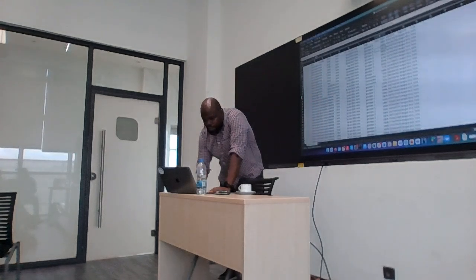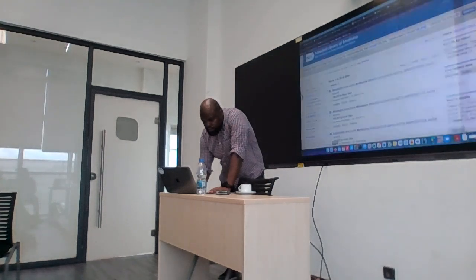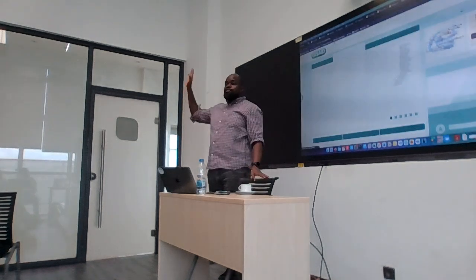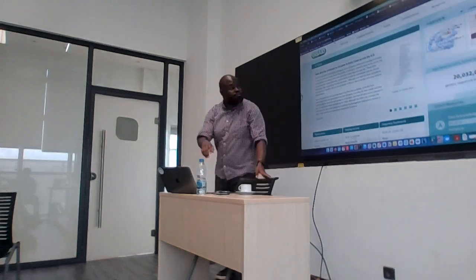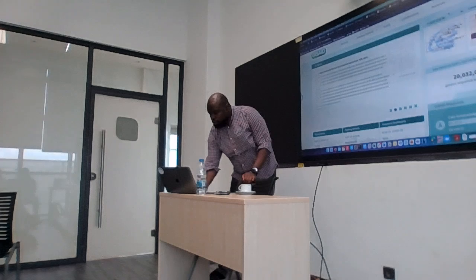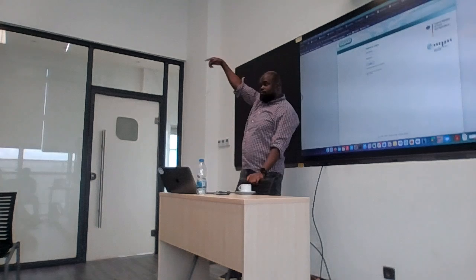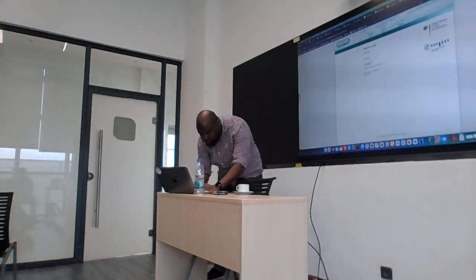Now, the other easier way of doing this is using GISAID, right? How many have used GISAID before? How many have GISAID accounts? How many are able to log into GISAID? Okay. Just a few. So you see, with GISAID, let me just see.